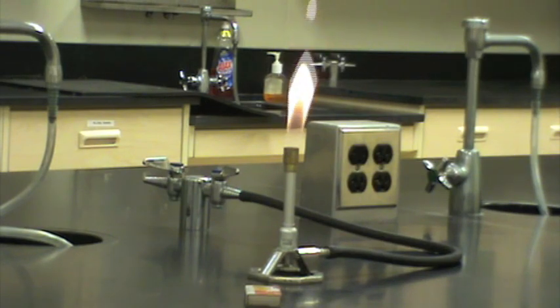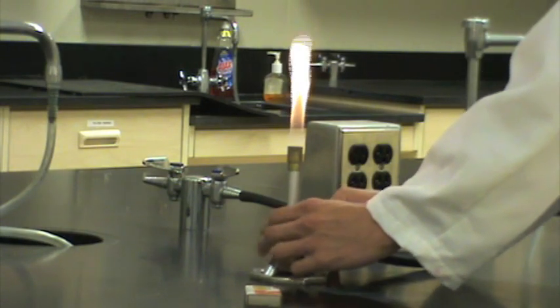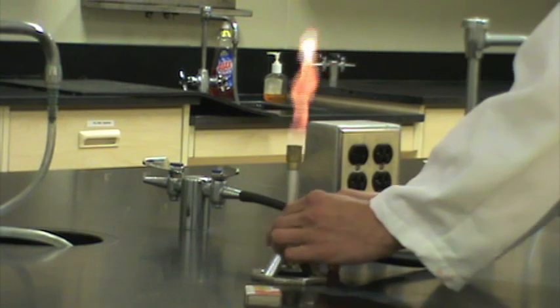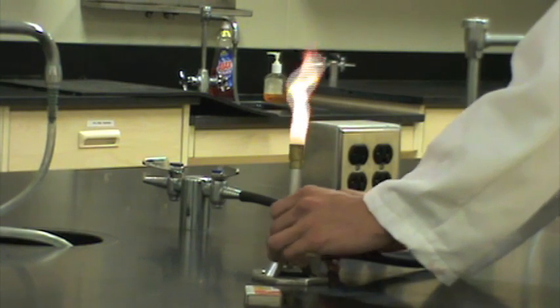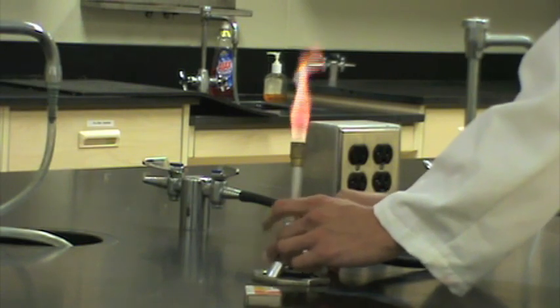Once you have your burner lit, you'll want to adjust the flame before using it. There are different types of burners, but they all have a method for adjusting the amount of air that is allowed to mix with the fuel. You are looking for a flame that is not too orange and has an interior blue cone.